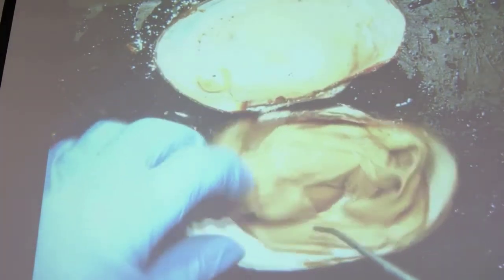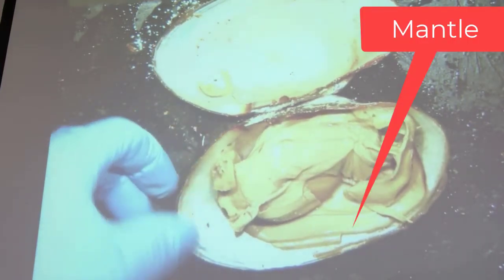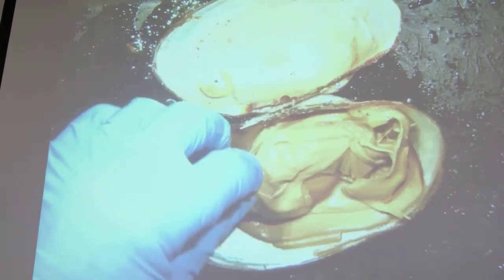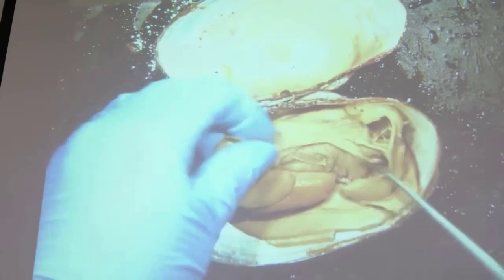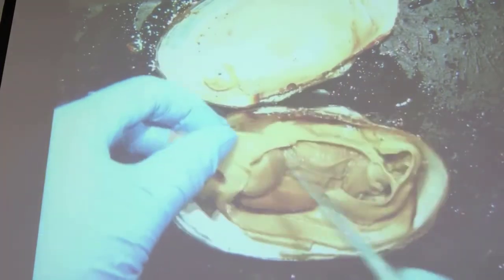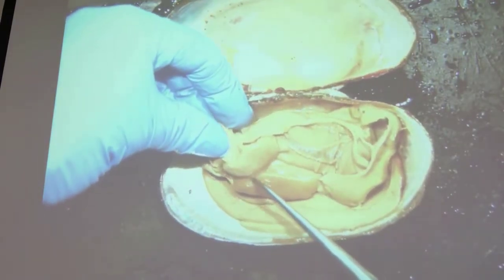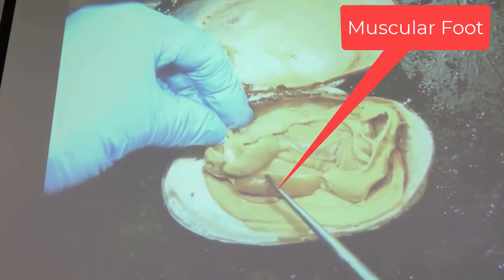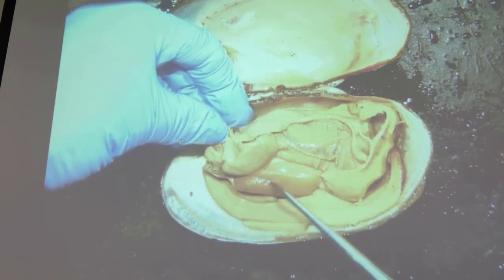So this thin material that is attached to the shell is called the mantle. It is one of the key features of all mollusks. They all will have a mantle. And if we move the mantle to the side a little bit, we can see some of the additional characteristics. So this is the muscular foot. It is one of the characteristics that all mollusks have, a singular muscular foot.